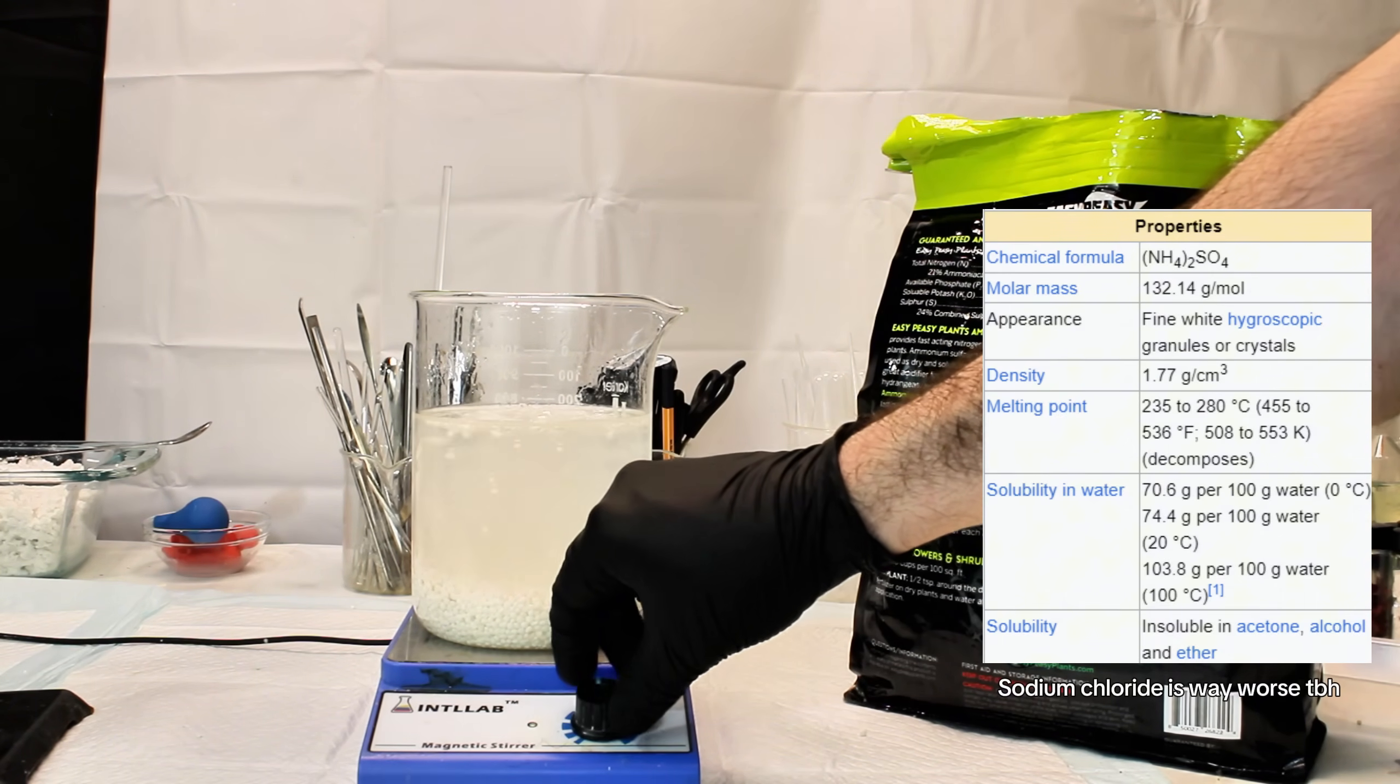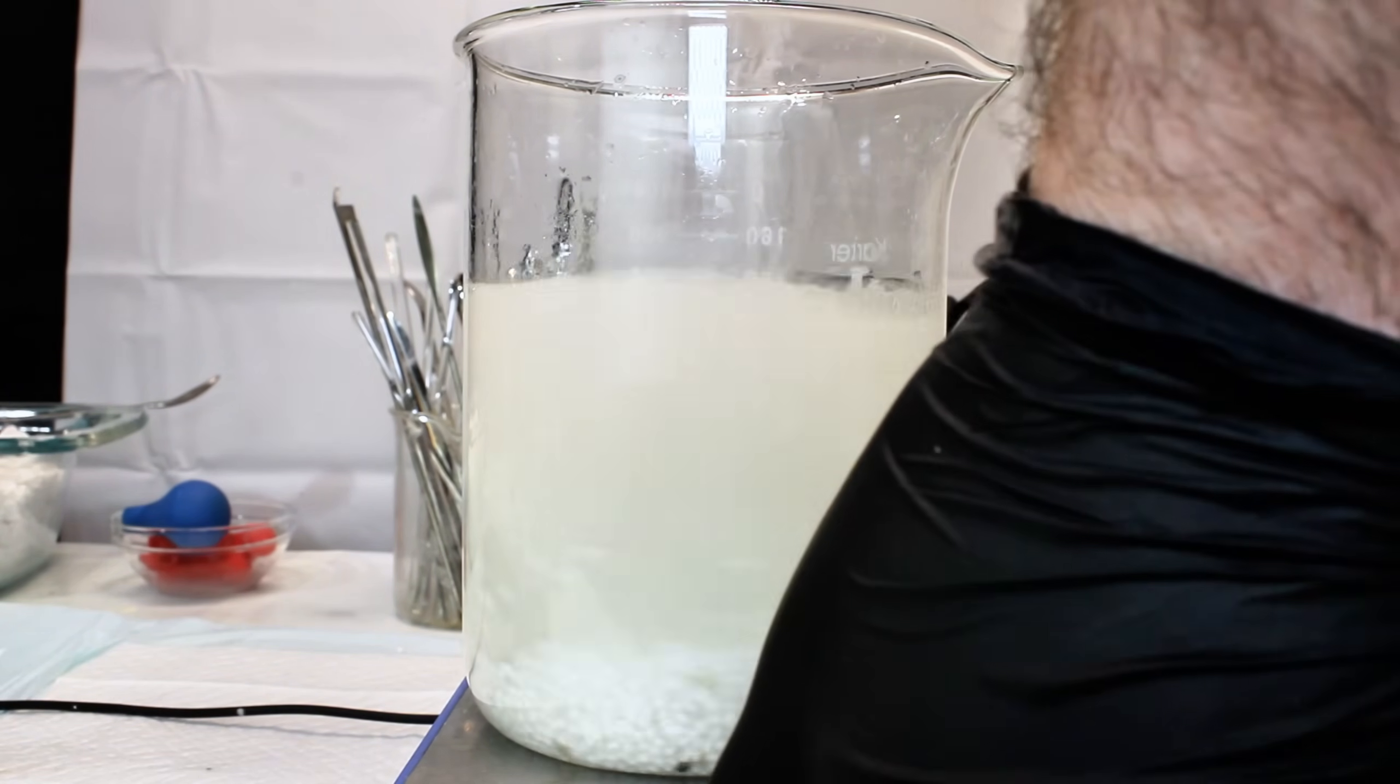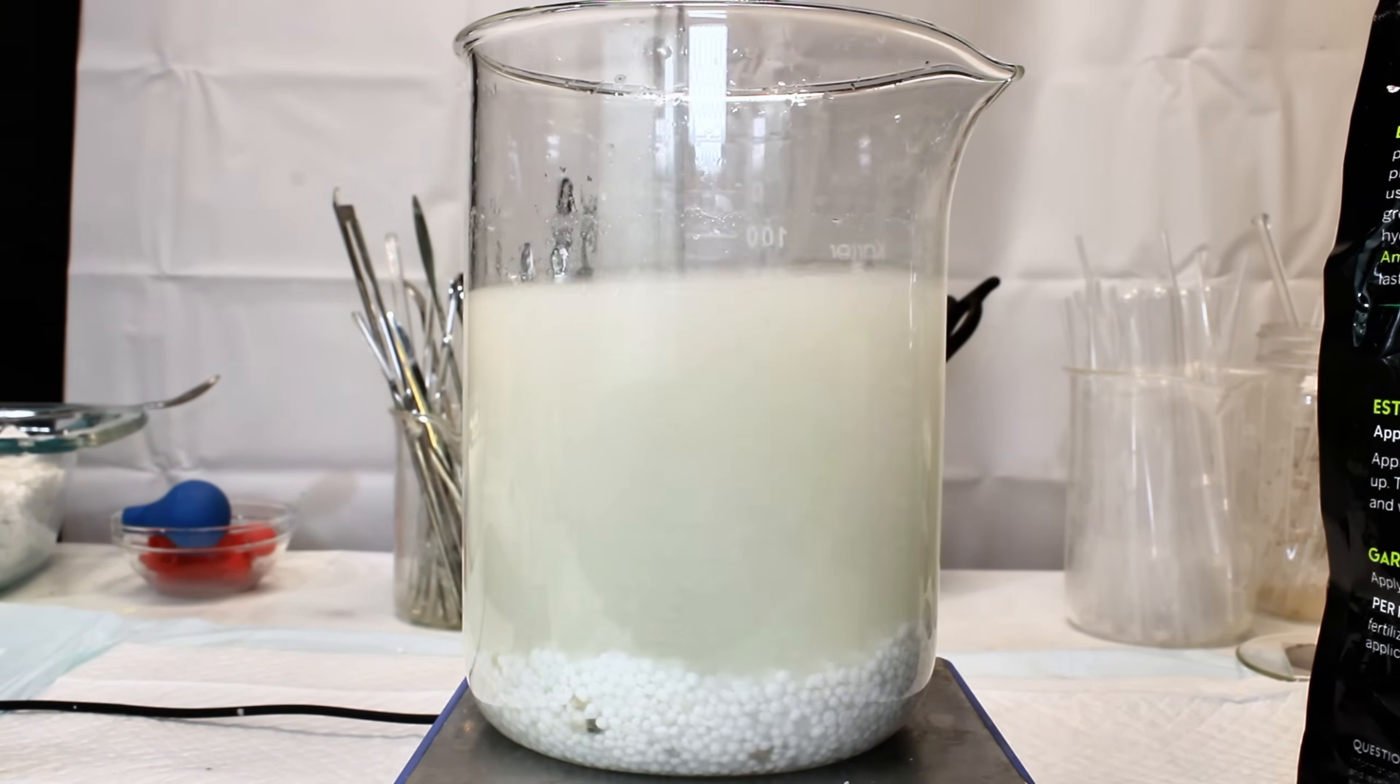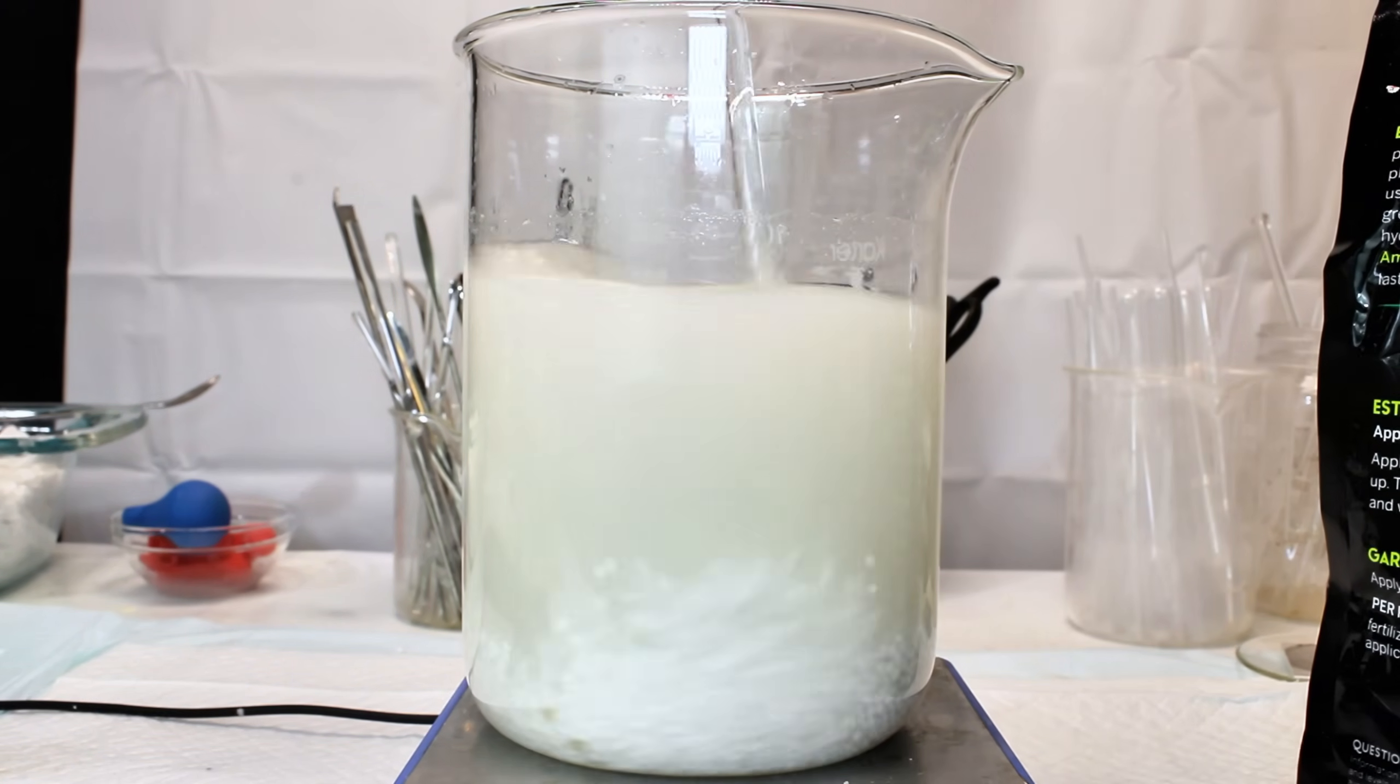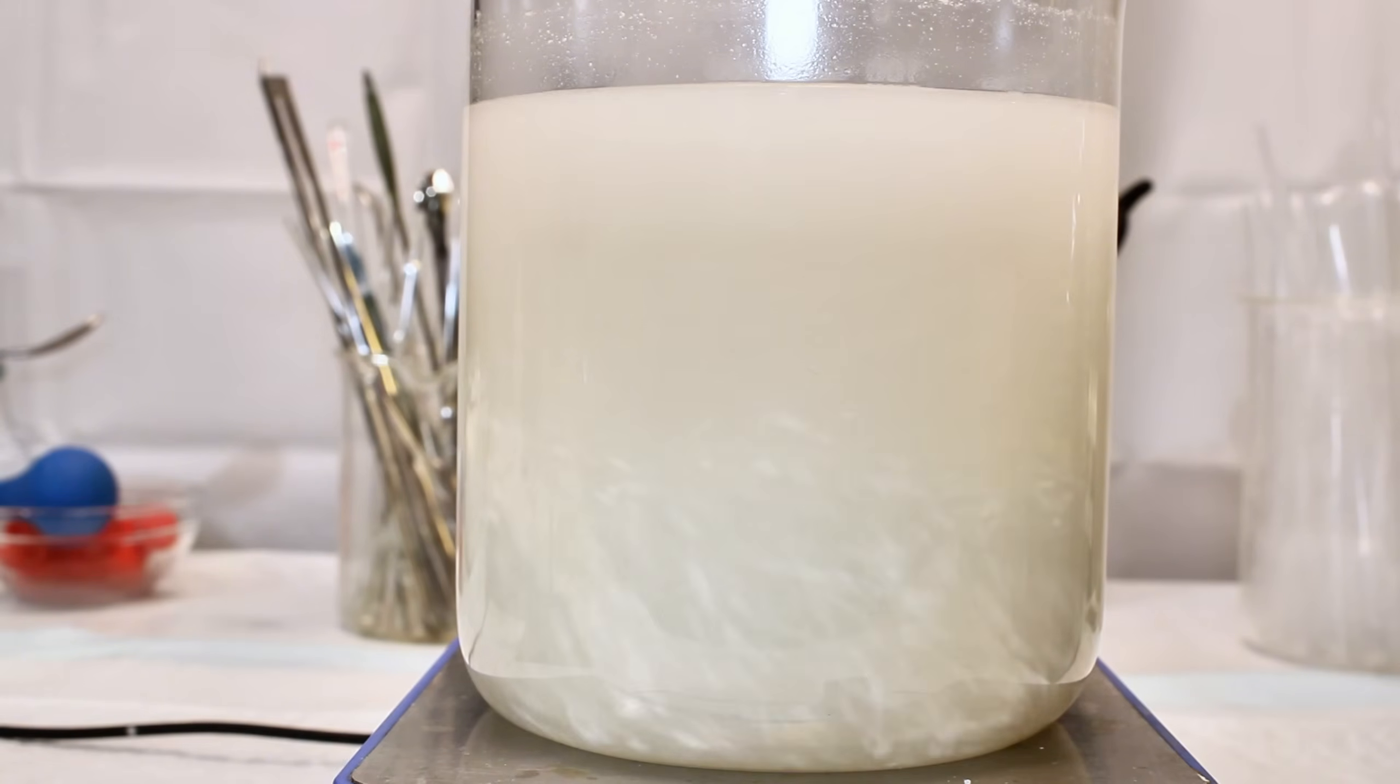That said, the only viable way to purify this is using evaporation, which is also the only viable way to purify sodium chloride for the same reason. In any case, to get started, I went ahead and dissolved as much ammonium sulfate as I could in a minimal volume of water, except this time I used 600 milliliters instead of 250.